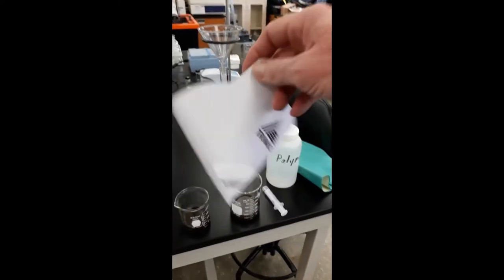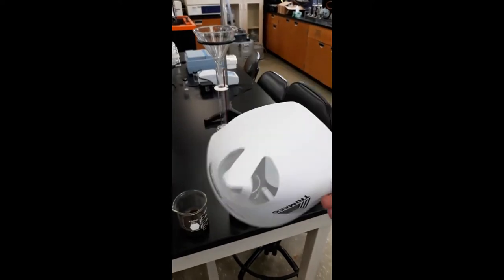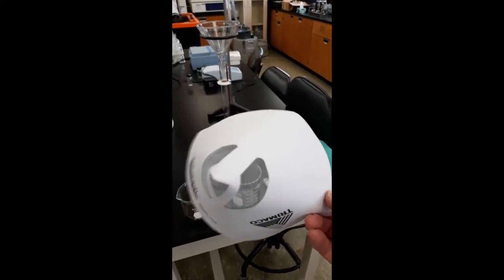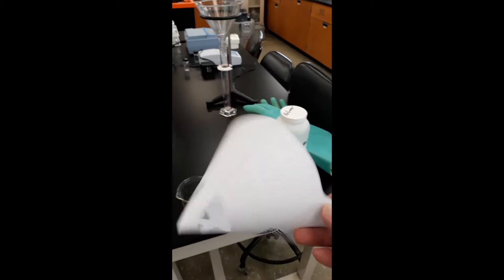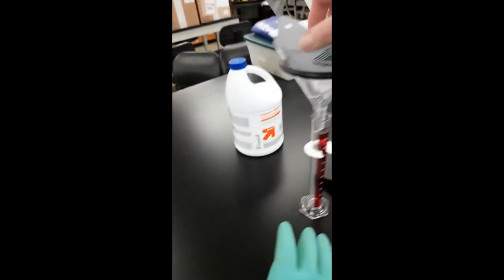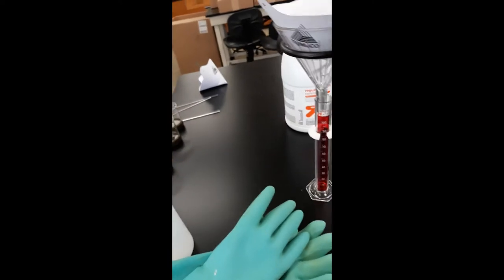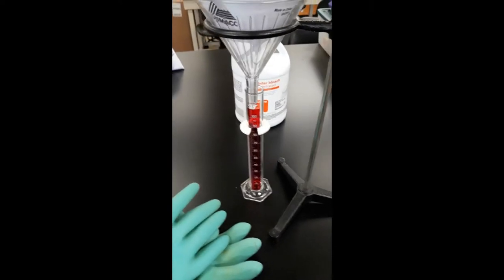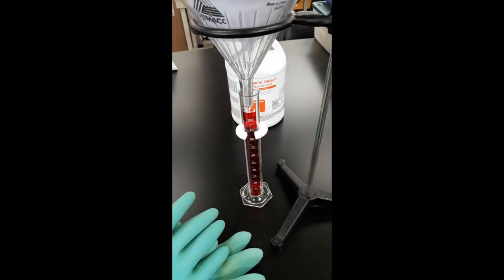Then we're going to use one of these paint filters. They make them a lot cheaper now, they used to have more filter to them. We'll put that in the funnel and pour the sludge in there, and we'll measure how much water falls into there in a five minute period.